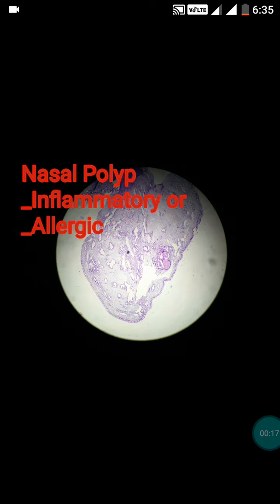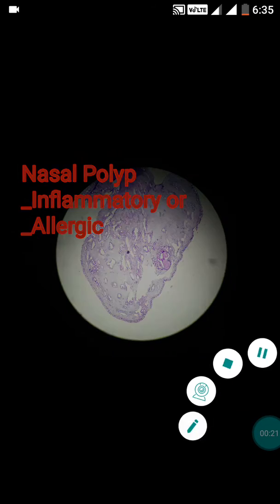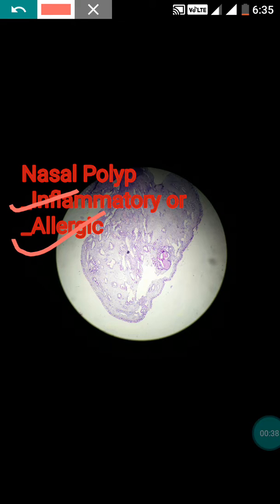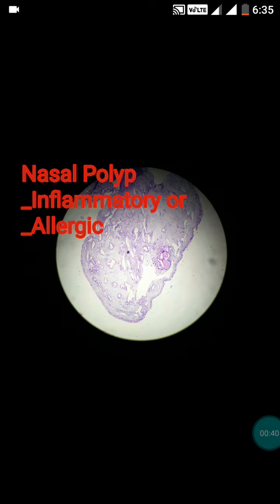The nasal polyp can be divided into two main types. If the polyp contains only chronic inflammatory cells, it is called a chronic inflammatory polyp. If it has a high eosinophil content in the stroma, it is called an allergic polyp. The third category is due to excessive mucus, called mucoviscidosis, which leads to cystic fibrosis.